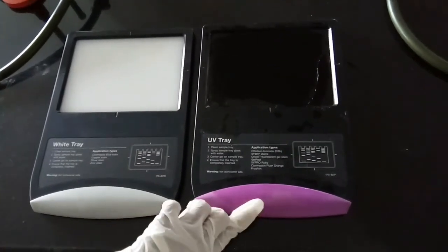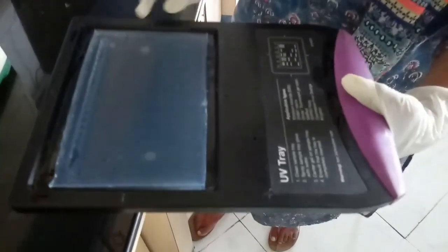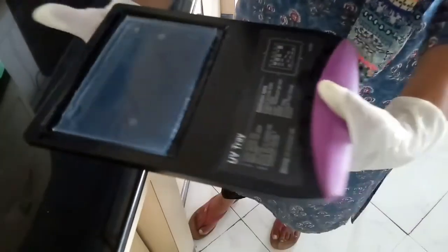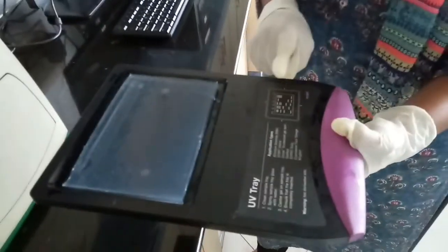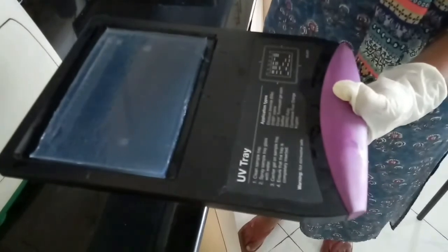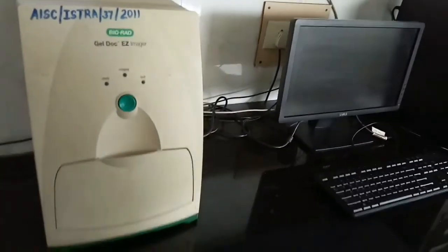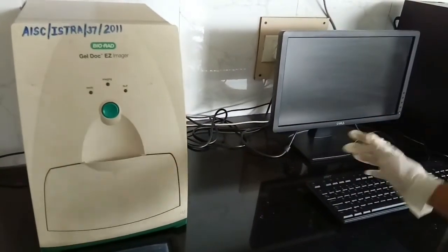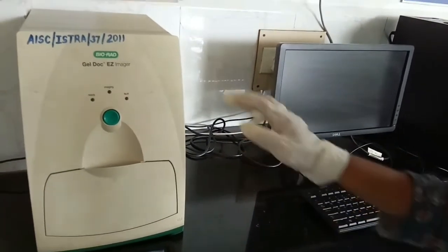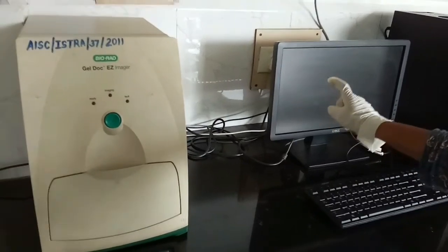We will now show the operations with the UV tray. Place the agarose gel on the UV tray. Now this tray will be added into the imager. The gel documentation system consists of two main components, the GelDoc EZ imager and the software.